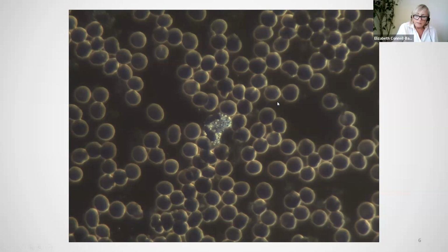And attendees can also send in any microscopes that they are looking at, and you'll be able to tell them if they're suitable, right? Yeah, absolutely. I'll tell them if they're suitable, and also if they're not, why they're not suitable. So I'll look at the actual specifications and compare with the specifications that we know are important, and then explain where the microscope actually falls short.